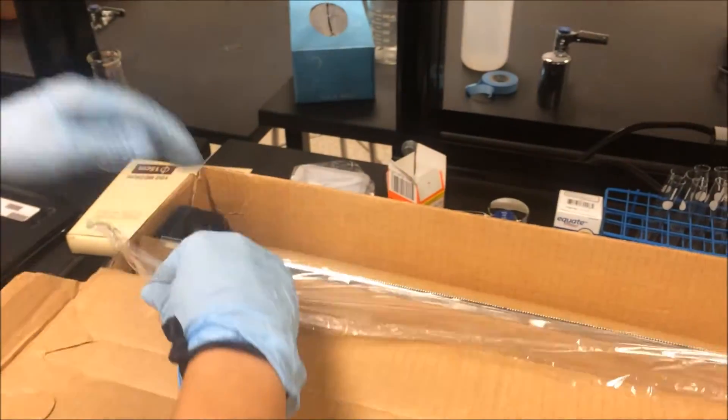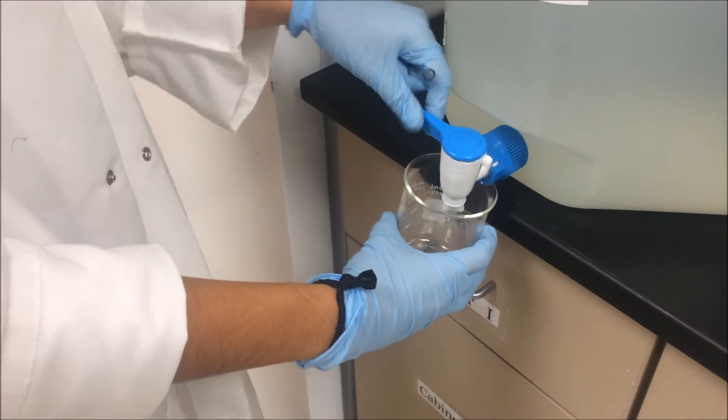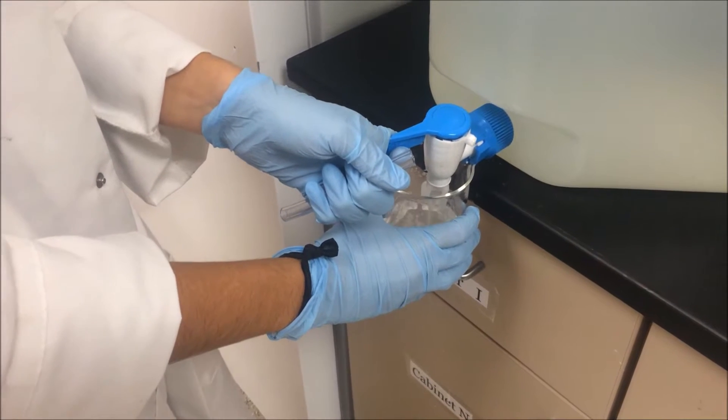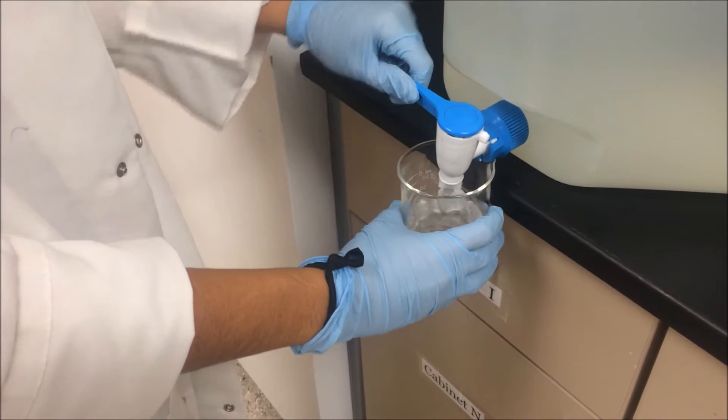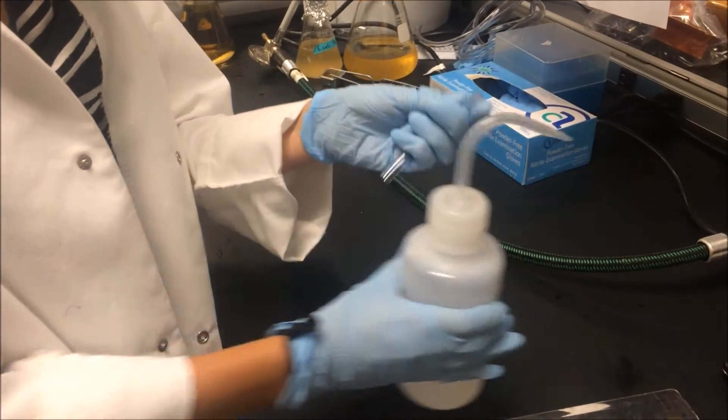Tear two pieces of plastic wrap. Get 100 milliliters of distilled water. Sterilize the tube with 70% ethanol.